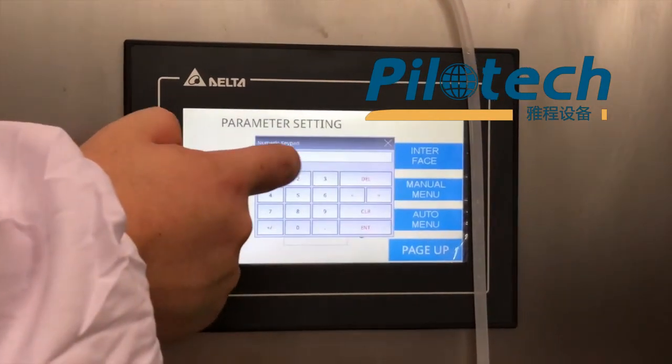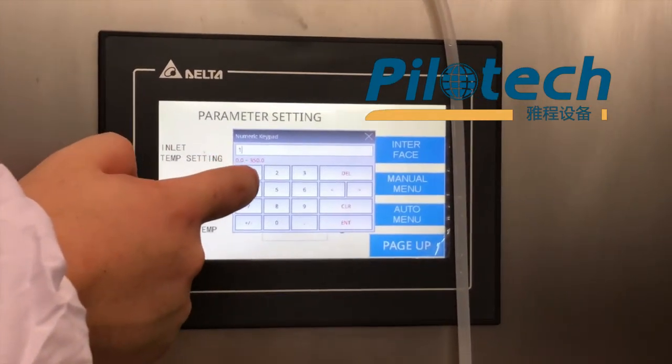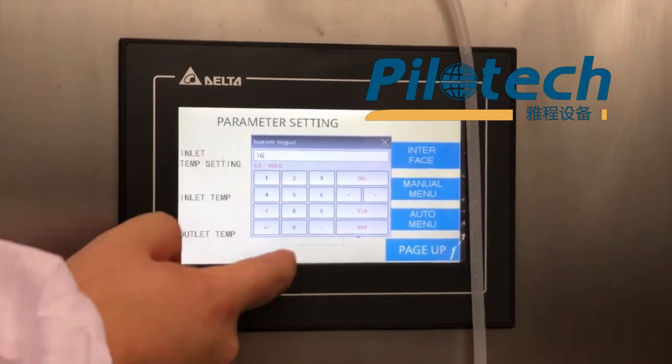You can set the inlet temperature you need here. For example, 160 degrees.